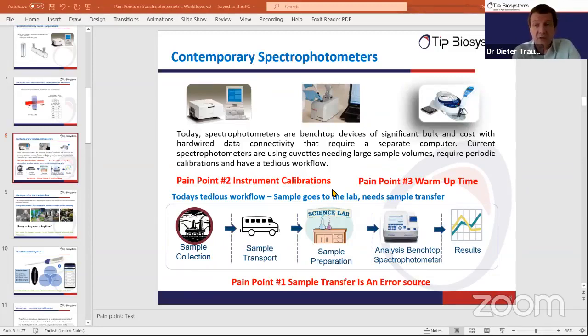For many, many decades, we worked with benchtop spectrophotometers of the type here on the top left, a picture in the slide. Those instruments are very bulky and big. They have a cable to a computer to control them. I also mentioned that, in my opinion, there were two big advancements in spectrophotometry. Of course, there were many little improvements, but I don't mean improvements here. I mean really game changers.